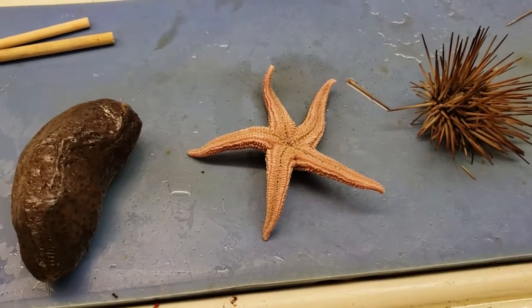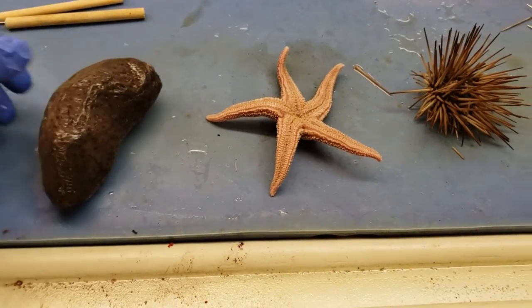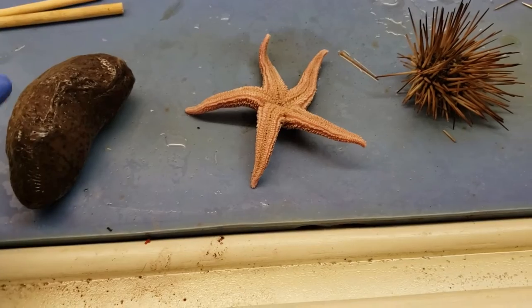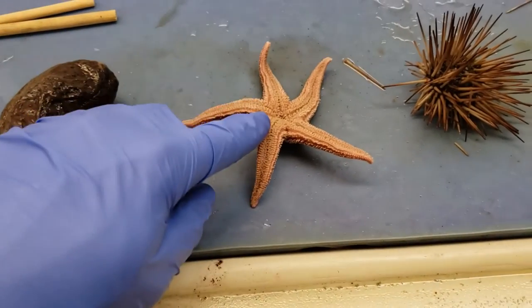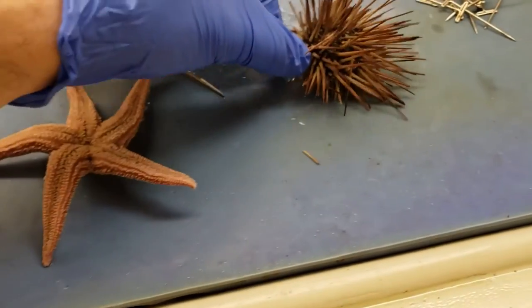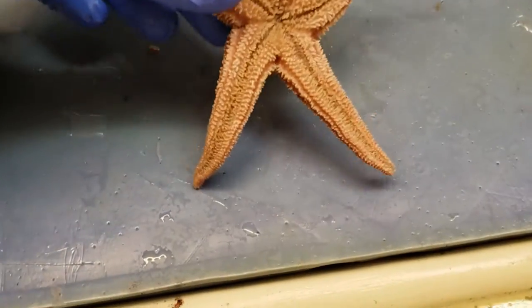Today we're going to watch them get cut open. We're going to start off with the sea cucumber over here — looks like a baked potato, which I had last night for dinner. It was very good. This is not a baked potato, don't eat it that way. This is our sea star, and this is the urchin. We're going to start off with looking at the external anatomy for the sea star real quick before we cut this thing open.